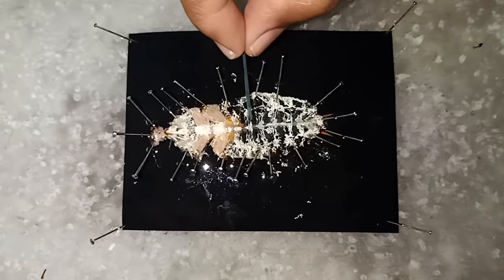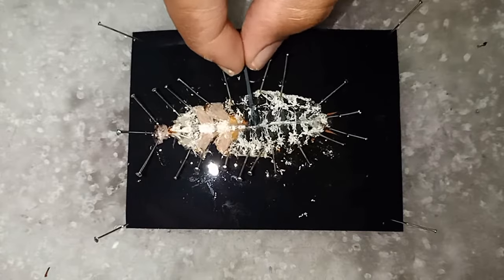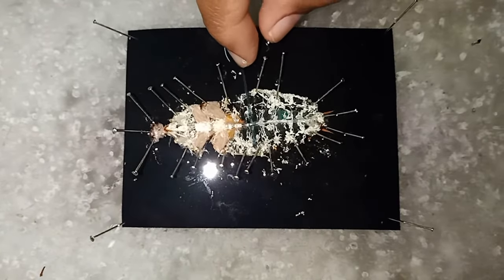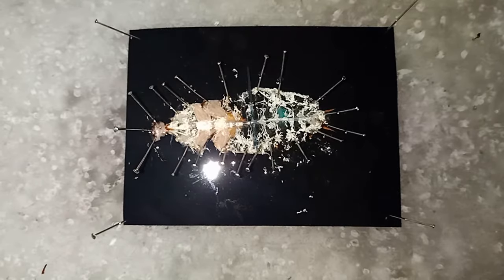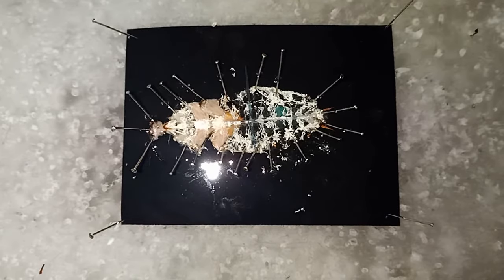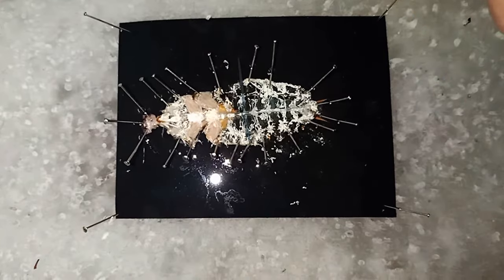The next step in exposing the nervous system is inserting thin X-ray sheets in between two nerve ganglions. The X-ray sheets may be inserted alternatively or continuously. An important point is the nerve cord should not be damaged while inserting the X-ray sheets.